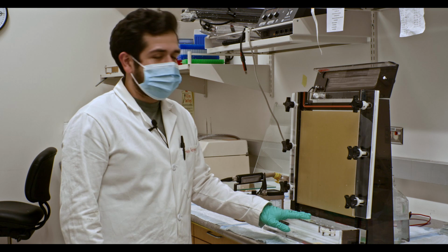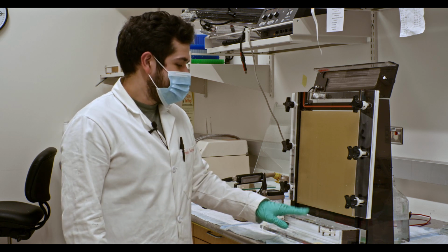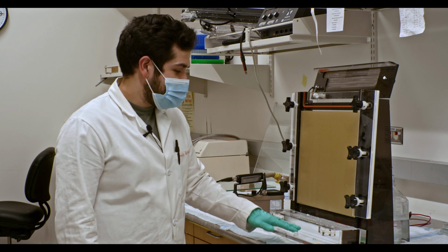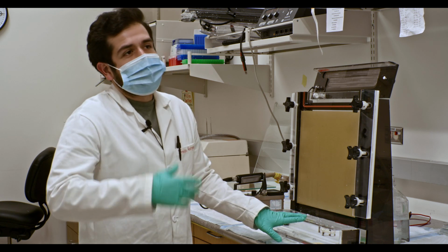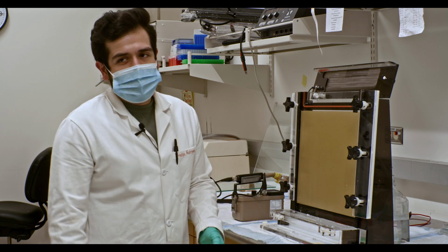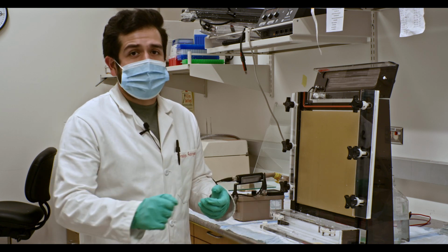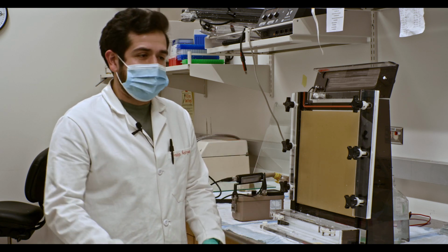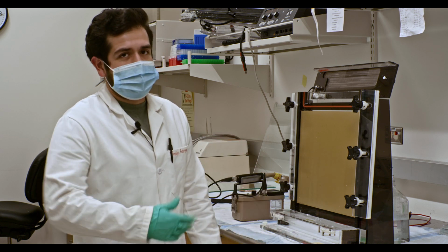Once we have the buffer out of the bottom component of this gel box, we rinse it out. Sometimes even if you leave a tiny little layer of what used to be there, it does tend to crash out and then you have these big salt crystals. If that happens to you, before your next run, you can just wash it with a little bit of water. It should readily dissolve, and then you can put it in a container and collect it, and then have this cleaned up, ready for next use.